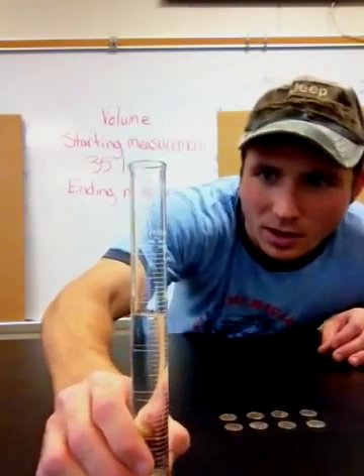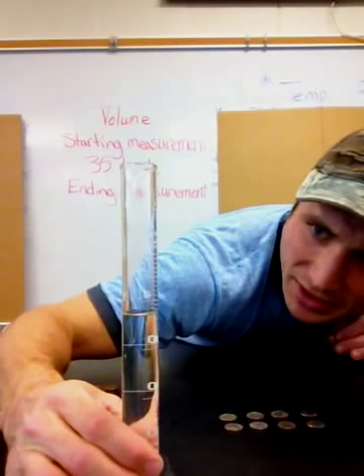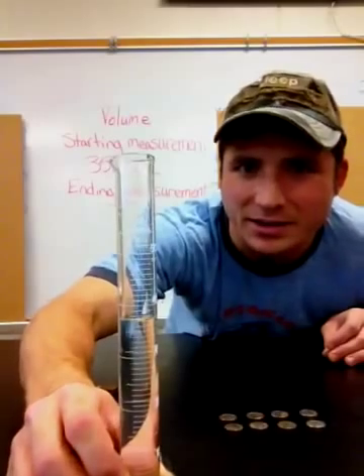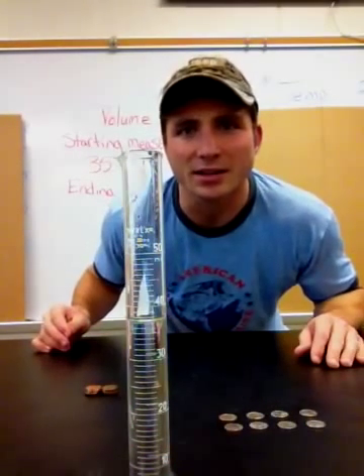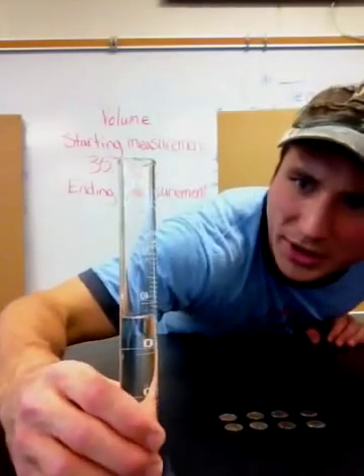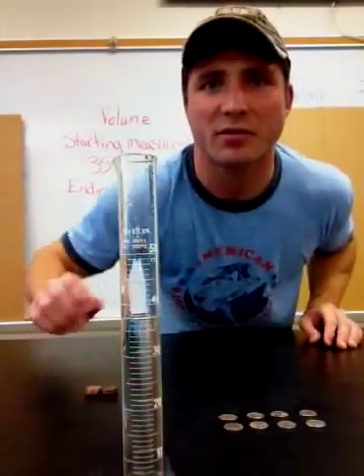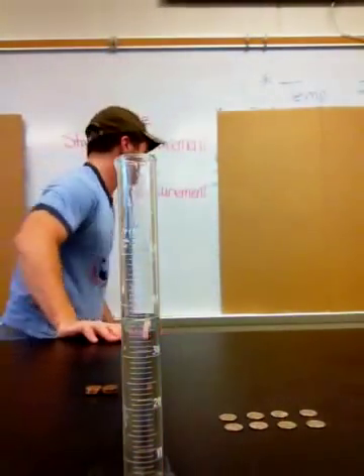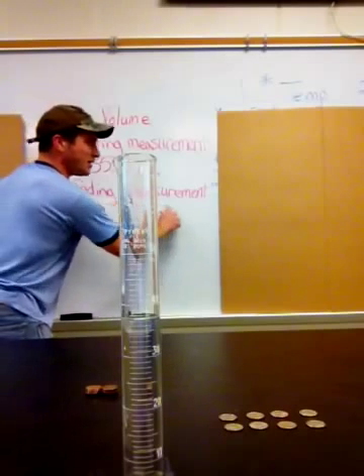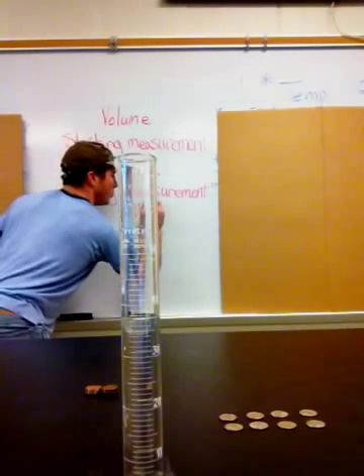Now you can look at the next measurement. It looks like it's just above 37 but not quite to 38. If you guess 37.5, I would say that's a pretty accurate read. Actually, I'm going to go with 37.2 milliliters — ending measurement 37.2 milliliters.